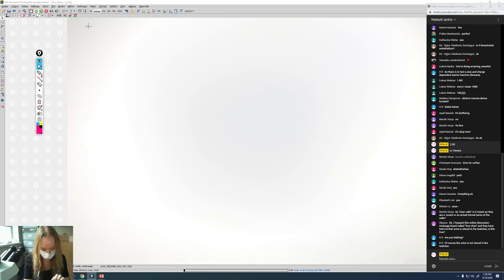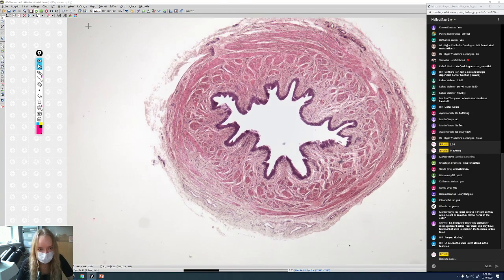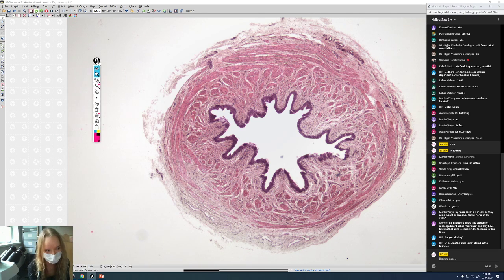Ureter is slide number 56. And you know, ureter itself is a small tubular structure, small organ. And this is the cross section of the ureter. You already know that the digestive system has its own structure of its wall, but the urinary system is somehow different, and we're now going to describe it.